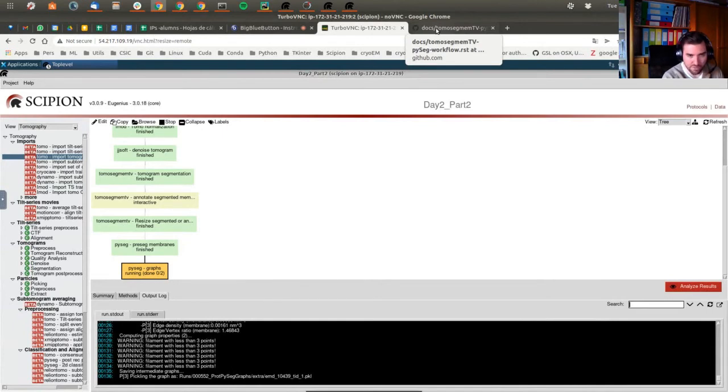Protocol provides performance. Yeah, Bram. Indeed, Pablo is working on Junior in terms of performance, and there's a lot of stuff that will be making everything even better.